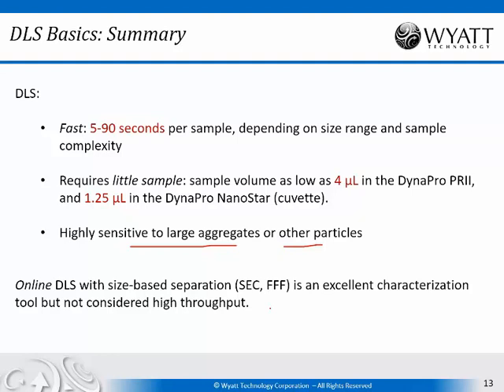You make its measurement. Again, the precision is quite good, a couple percent. And by that means, you can get a pretty high resolution technique. Now, obviously, the dynamic light scattering plate reader doesn't support a flow-through cell, but we do offer other instruments that include a flow-through dynamic light scattering cell.